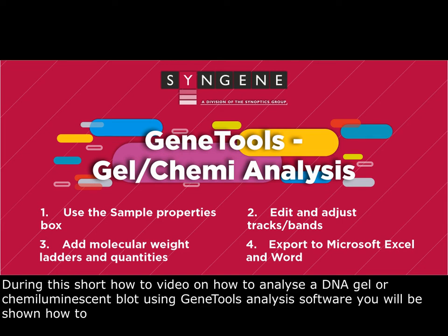During this short how-to video, you'll learn how to analyze a DNA gel or chemiluminescence blot using GeneTools analysis software.